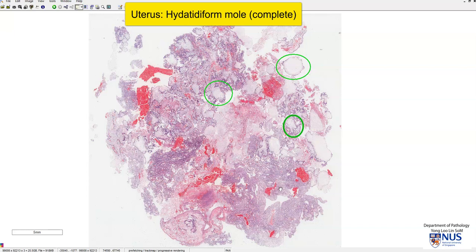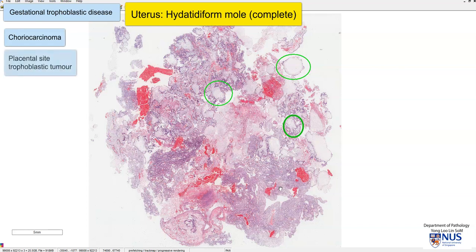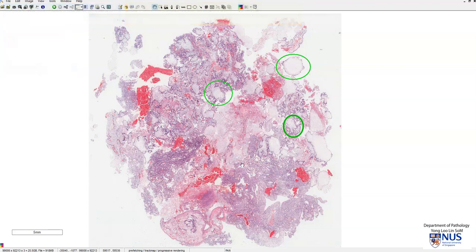A complete hydatidiform mole is part of a spectrum of gestational trophoblastic disease, which includes hydatidiform mole, choriocarcinoma, and placental site trophoblastic tumor. Within hydatidiform mole itself, there is a spectrum including partial, complete, or invasive mole. More detail on the gross features is covered in the accompanying video.